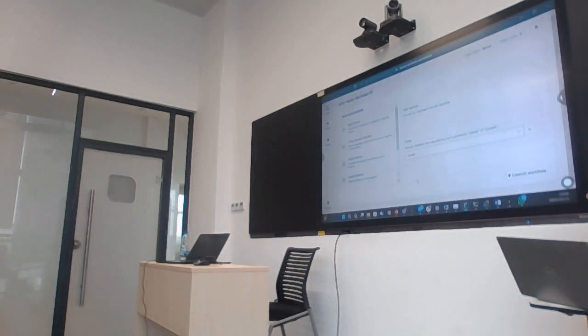If you don't know what clade it is, at the moment you have problems. This is a damn good question for my colleague over here. What do you do if you don't know what clade you've got?